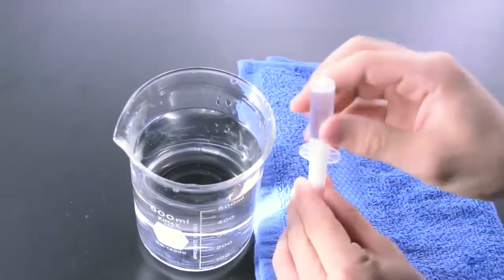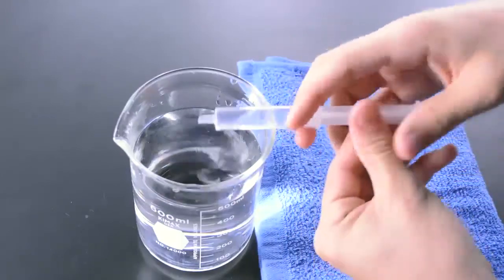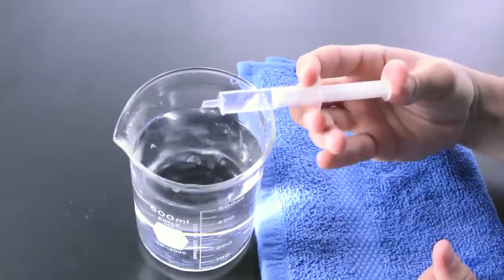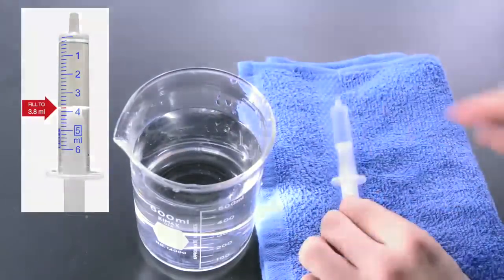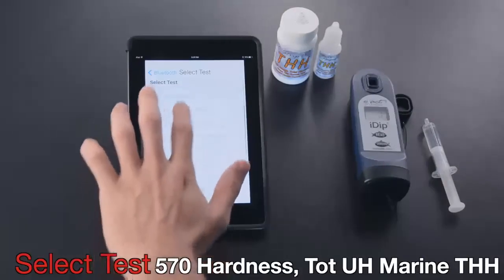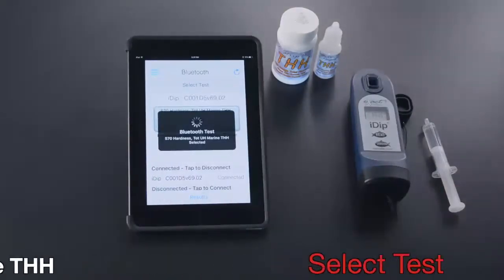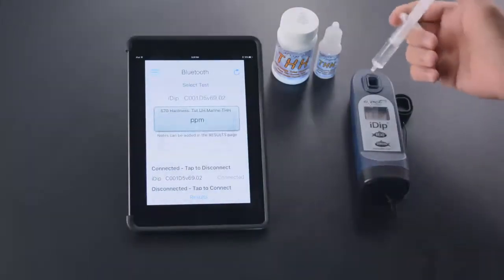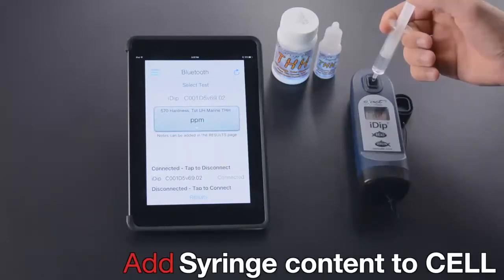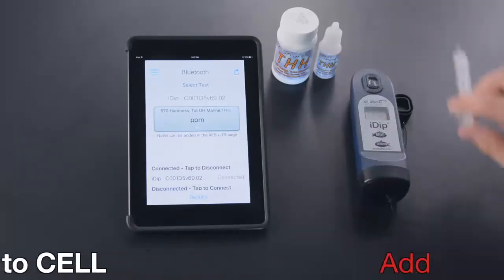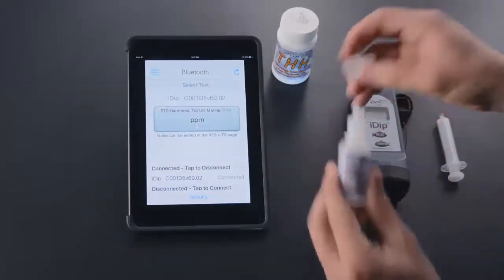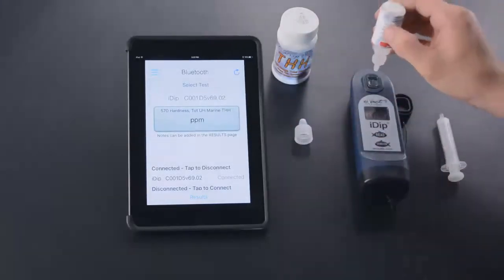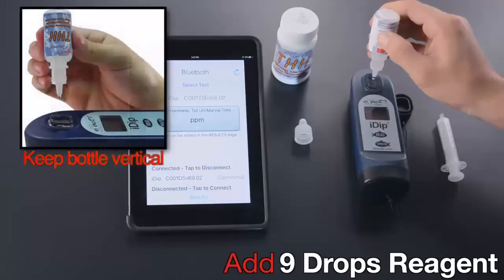Remove air bubbles, reduce to 3.8 milliliters, select test, add syringe content to cell. Add nine drops reagent.